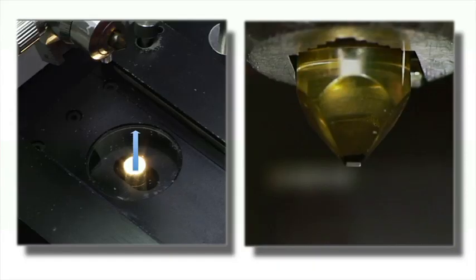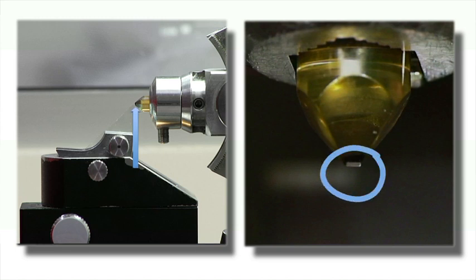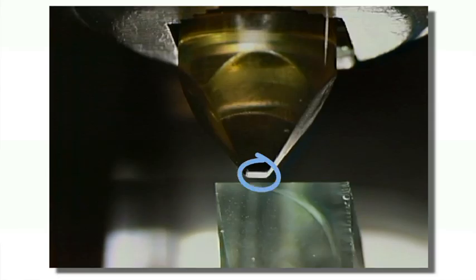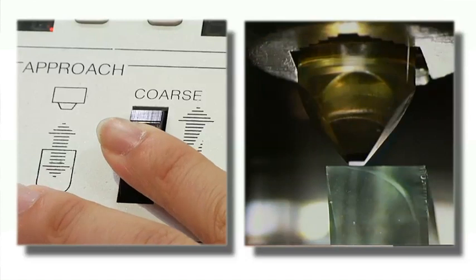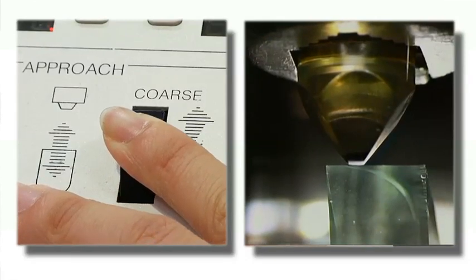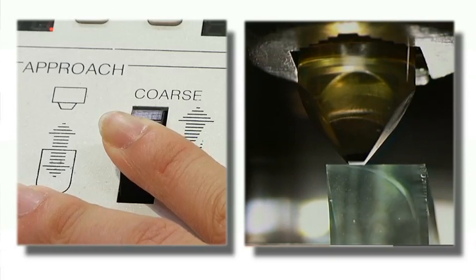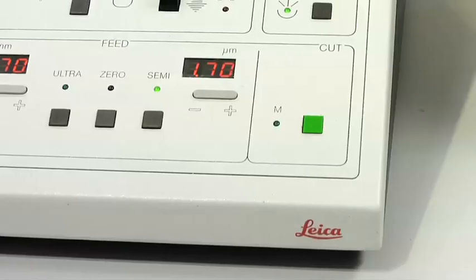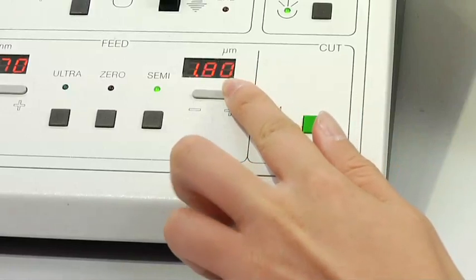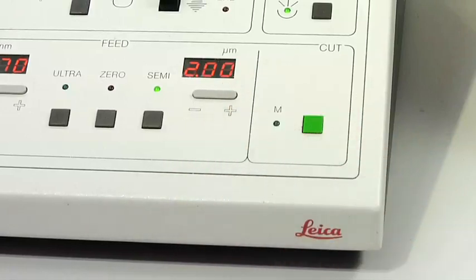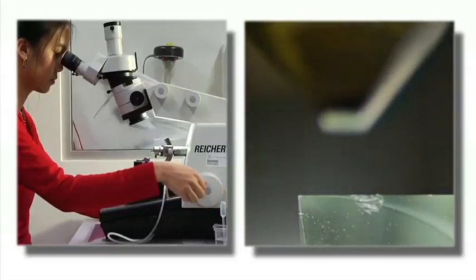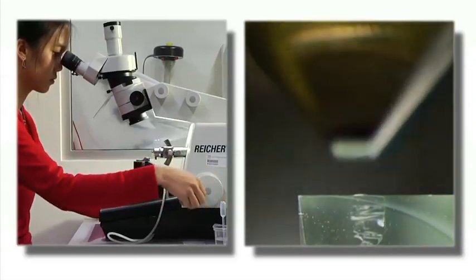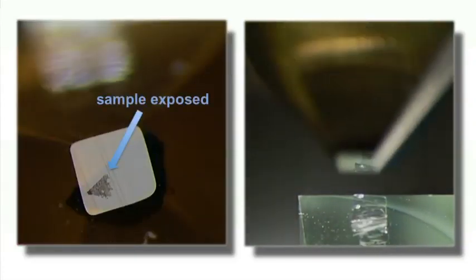The bottom light, reflecting off the knife onto the block, illuminates the block face. This reflection determines the distance and the angle of the knife relative to the block face. Using the coarse approach control, approach the knife toward the sample until the reflection is around an eighth of the block face size. Set the feed to semi-thins and step size to 2 micrometers. Manually turn the hand wheel clockwise and keep sectioning until you have the desired amount of tissue exposed.